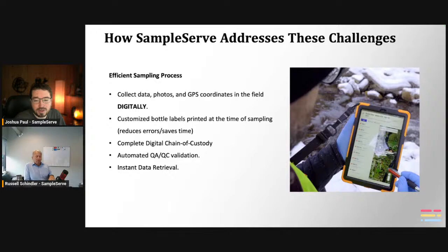It's available as a data file, which can then be pushed into another platform, Equus, or into the lab's LIMS system. But we also generate a PDF as well, so that human beings can look at the raw data on a PDF, which you can print out on a piece of paper if you want to as well. So the data is available in different formats that have different purposes, but it's all right there, useful.